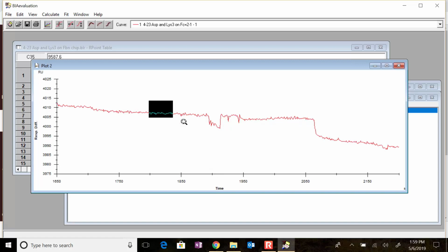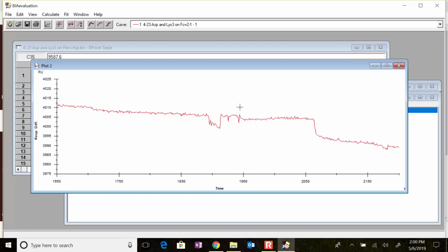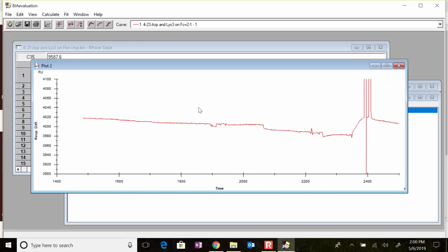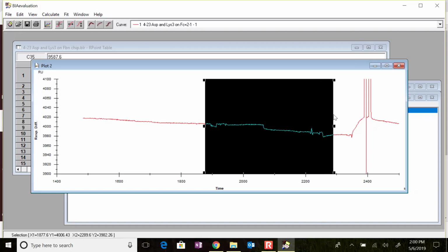1889, well actually I want to zoom in a little bit more. I want to see where 1889 is relative to this. See, 1889 is here, but basically I can go ahead and take this and decide later. If we take multiple blanks, we can later decide that one of them isn't a good blank. And the one thing that's hard about blanks is finding out where they end, okay?